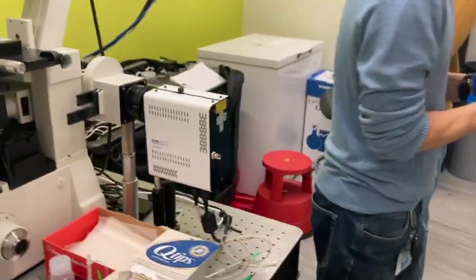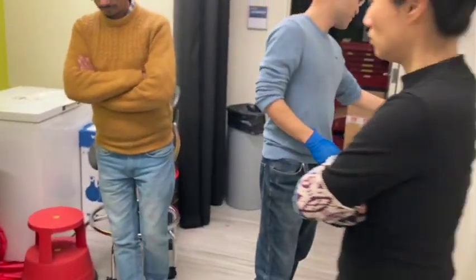and that's one thing. And at this point I need to turn the light off to show how the TIRF works. So please go this way, and be safe, leave some room here.